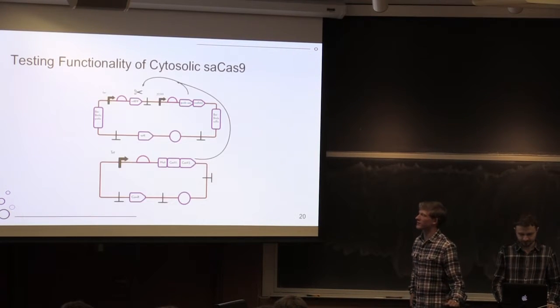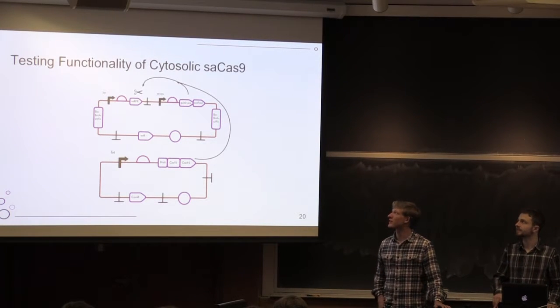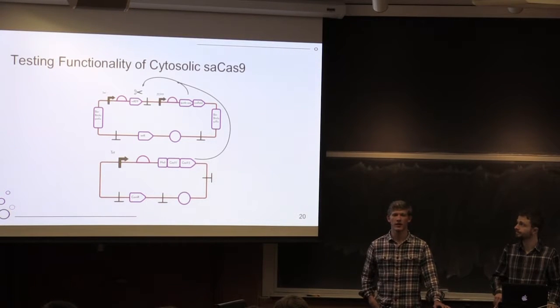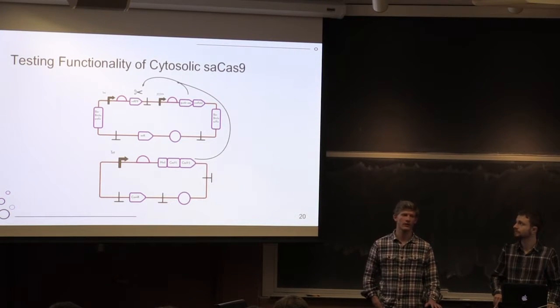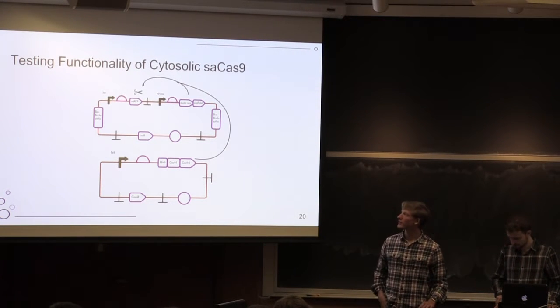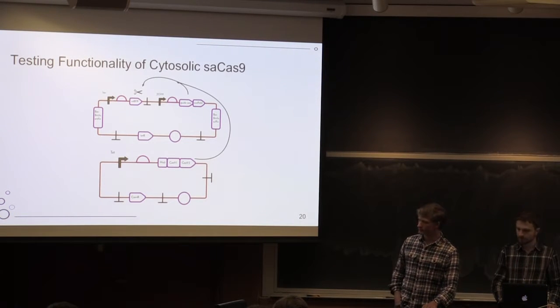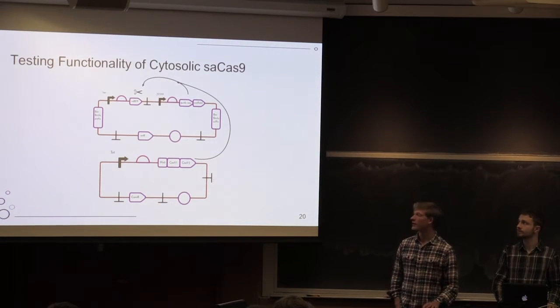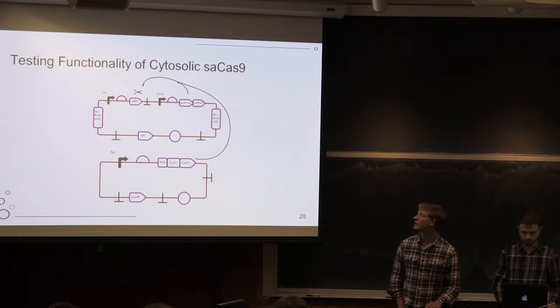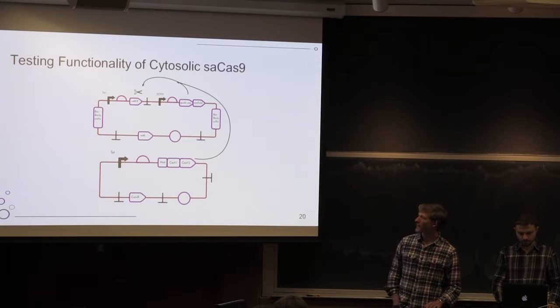For this, we had to construct a gRNA device. We synthesized a gRNA scaffold that included a template guide sequence that can be swapped out with Golden Gate for whatever specific sequence you want. We cloned that part into a vector that includes mRFP and co-transformed those two plasmids together: one with a guide sequence that's just a template that doesn't target mRFP, and one with a guide sequence that targets 100 base pairs in mRFP.